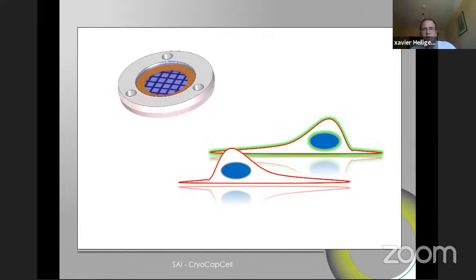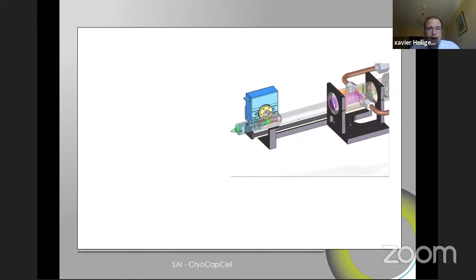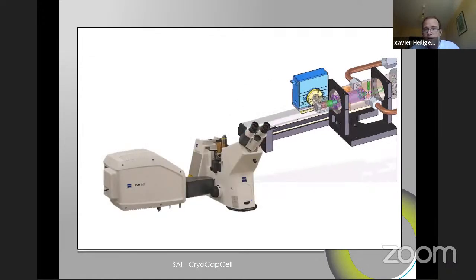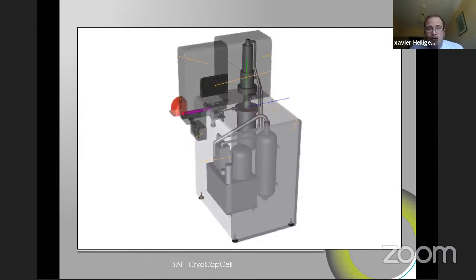So just to give an overview of the system, basically we have a heterogeneous population of cells which are expressing or not a mutation, that's up to you. We load them into the Cryo Capsule, which is a small petri dish, a very advanced small petri dish, handled by this clamp standing right above a light microscope. And we'll come back to that point. So you just do live imaging, and at a given time, you retract the sample, freeze, and then drop it down into liquid nitrogen.